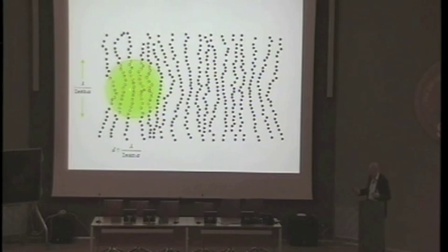More or less at the same time, because the light comes at the same time to a large area, not to a small area. Now, if we could concentrate the light further down than this, there are, in principle, ways of doing that, but not with a lens. For example, with a very tiny tip, then we could go to this first, and to that first, and that first. Then we could separate it. But if we maintain the concept of focusing, using just lenses, and keep the light freely propagating, there is no way. All of them will be flooded at the same time. And so people have said, okay, forget it. You will not be able to separate anything.